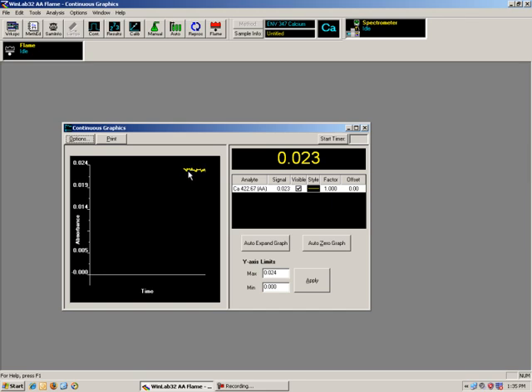background just in air. We can actually auto zero this. And now it subtracts out that 0.024 and sets it at 0.00. We should see fairly small variations around this line. Remember, the graph here is set at a very low level anyway, so our noise down here is probably less than 0.001 absorbance units.